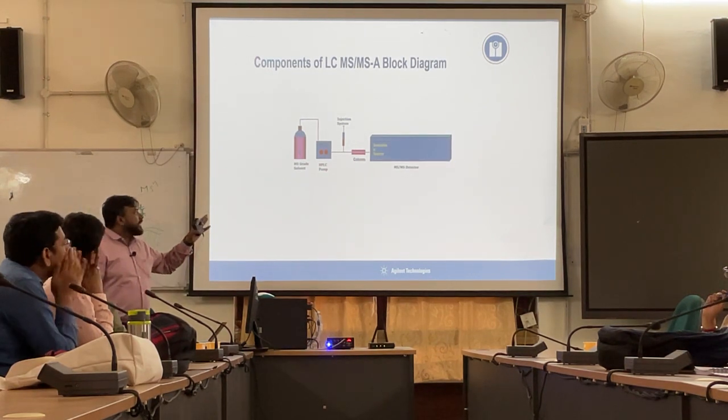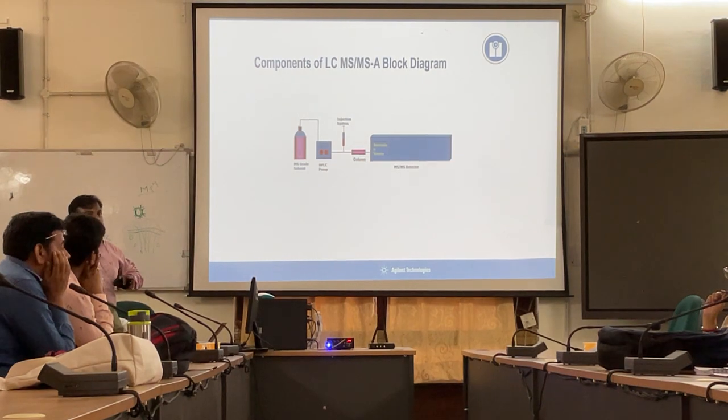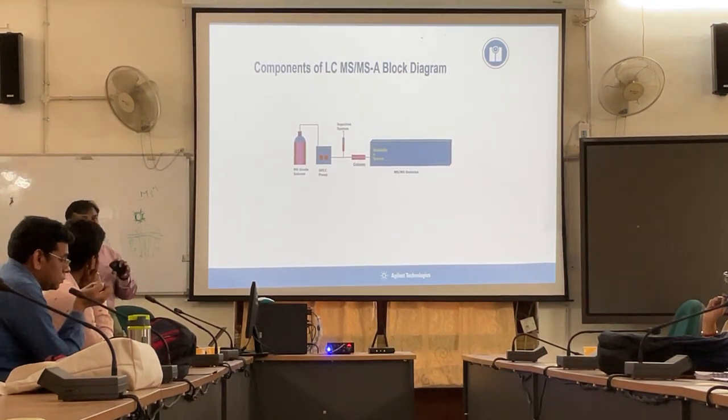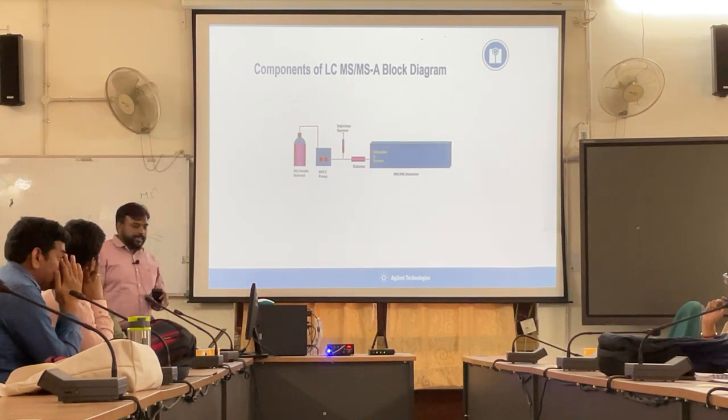After that we are using MS as a detector. We can use UV also as a detector, in case you want to confirm the compound on the basis of UV, and then further detect the same with the mass spectrometer as a detector.